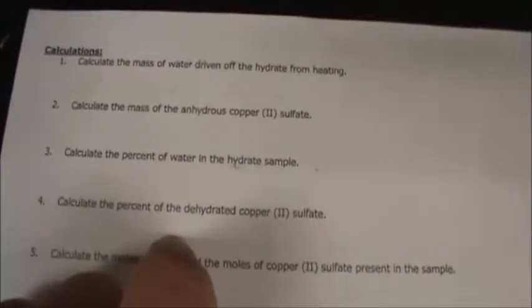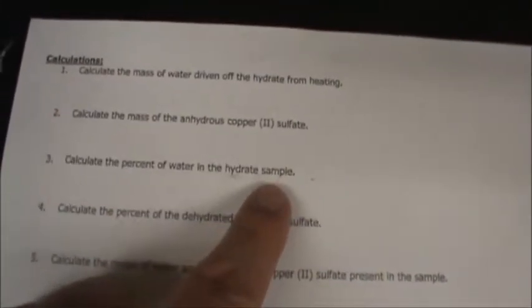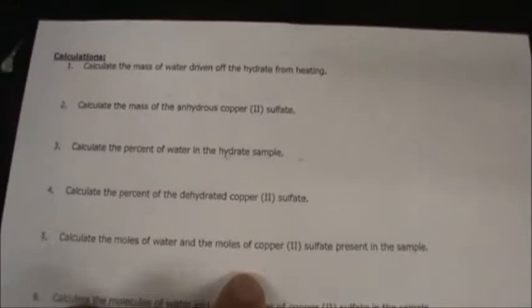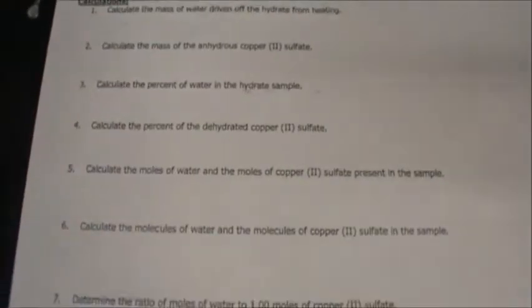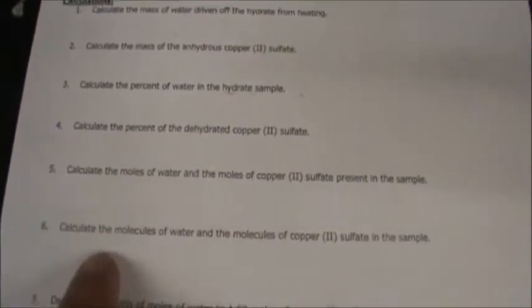This is doing percent composition using a sample. Remember, you're just doing a percent composition with a sample from the lab. You recorded all the masses at the very beginning of this procedure. And then the rest of this is mass, moles, molecules. So you're going to need molar masses from your periodic table for the particular chemical that you're dealing with, either water or copper sulfate. And then from there we have some ratios to deal with.